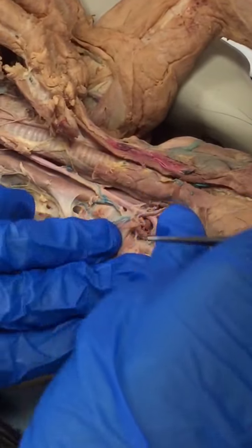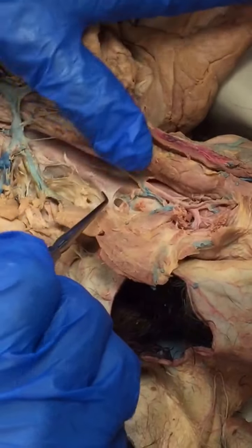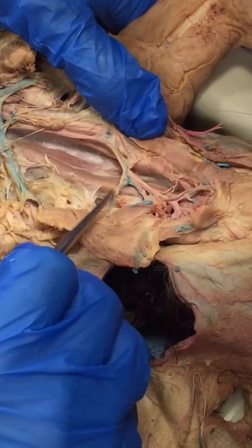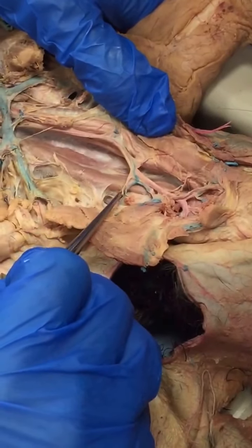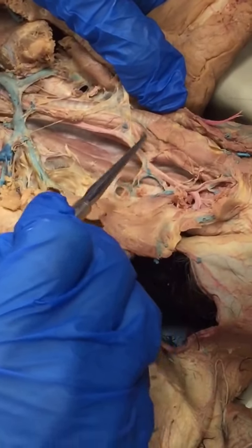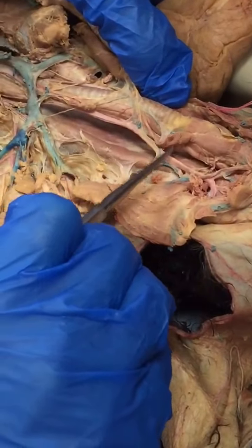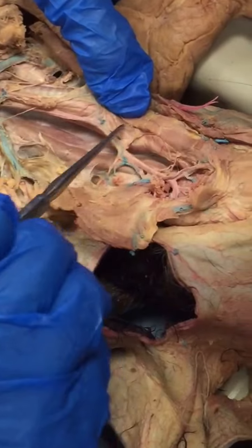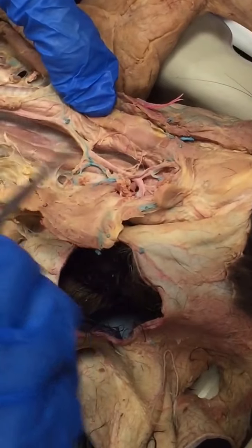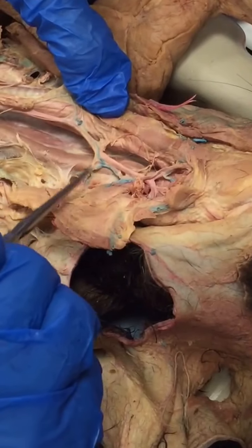carotid here, okay, we're going up the left internal carotid here. This first lateral branch is the muscular artery and vein. Then we have the cranial thyroid artery. The thyroid gland is usually right in here. It'd be like a dark spongy tissue that's mostly been removed, but you might encounter that. So you have cranial thyroid and muscular. This is all common carotid coming up here. Cranial thyroid this side and muscular on this side.